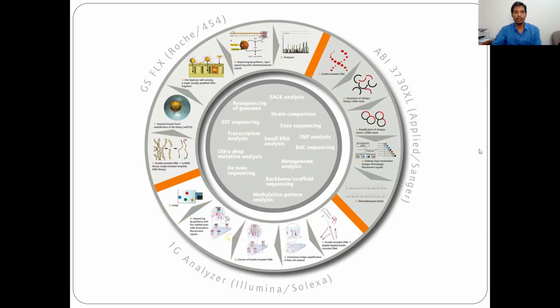a slide for you. Before that, next generation sequencing: why are we including this? Most of the laboratories now are working on next generation sequencing. It is almost like a must now. Many areas of research are metagenomics, transcriptomics, metatranscriptomics, or just genomics.